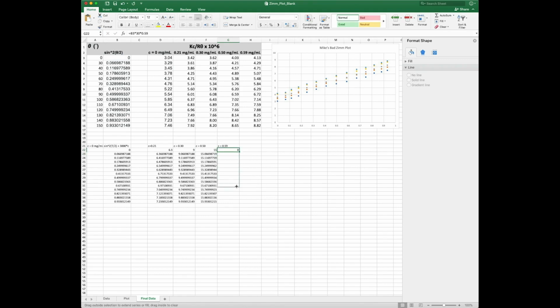So now these will be the values for my x-axis. These are going to offset the data. And you can kind of see how that is. This should be plus, not times. Okay, so everybody should increase. And now I'm going to plot the data.